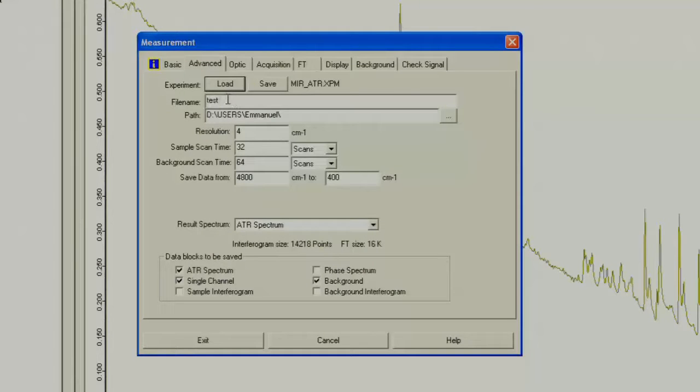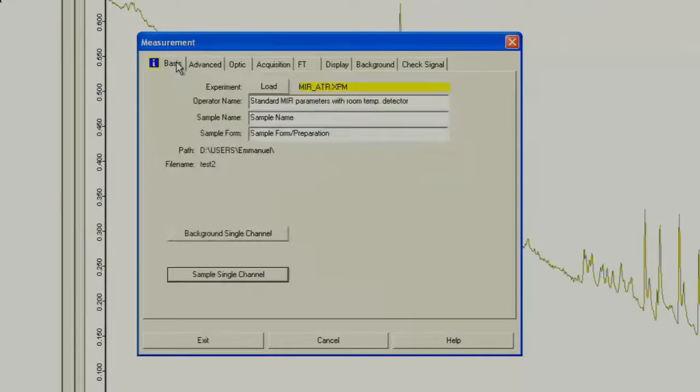Now you can go back to the advanced tab, and change the file name. After you change the file name, go back to the basic tab, and click sample single channel.